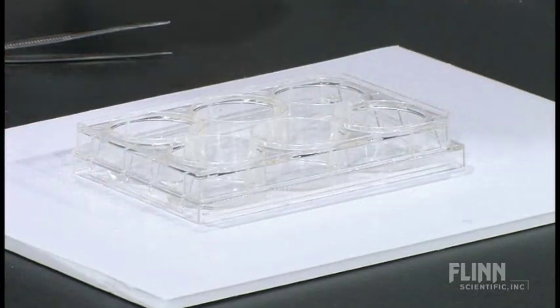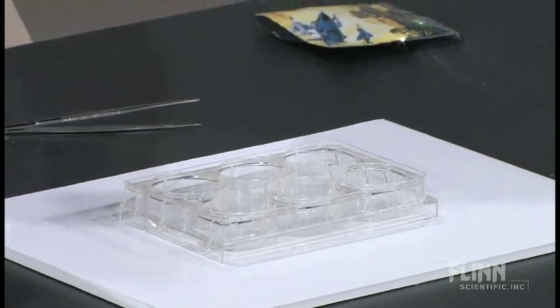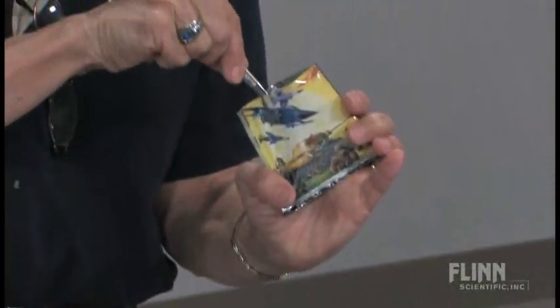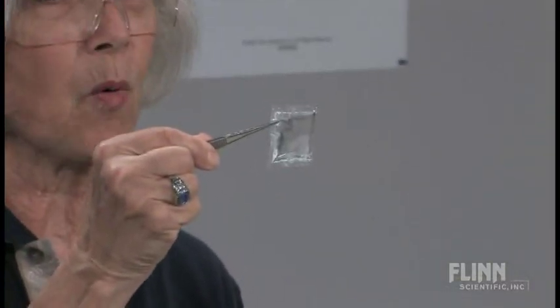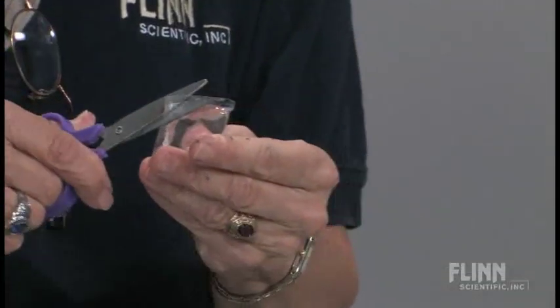Now, let's just take one of the bomb bags here, and I'm going to cut it open. And when I reach into the bomb bag, one of the things I pull out is a little packet that the bag describes as magic water. Now, is it water? Does it have citric acid dissolved in it? Does it have baking soda dissolved in it? Does it have some combination of those? So what I'm going to do is cut open the packet, and I'm going to put some into the well plate, and then we're going to compare it and find out just what the nature is of our magic water.